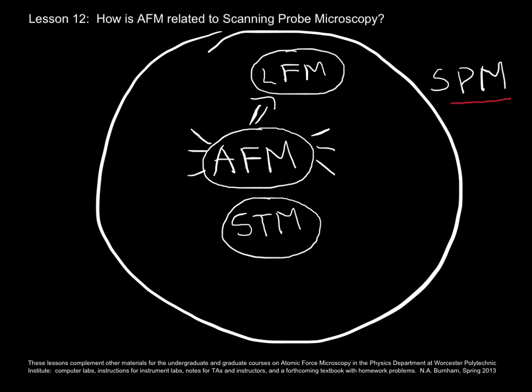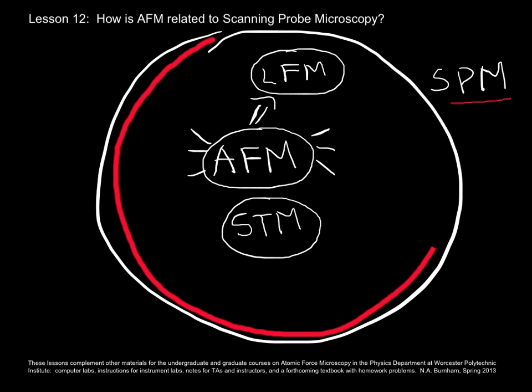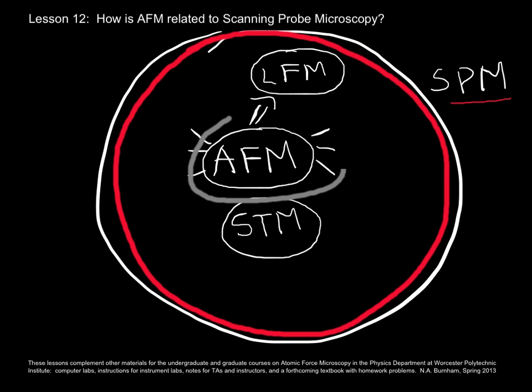In summary, what we did in this short lesson was to talk about the operating principles of the family of instruments called scanning probe microscopy, of which atomic force microscopy is the main focus of this set of lessons.